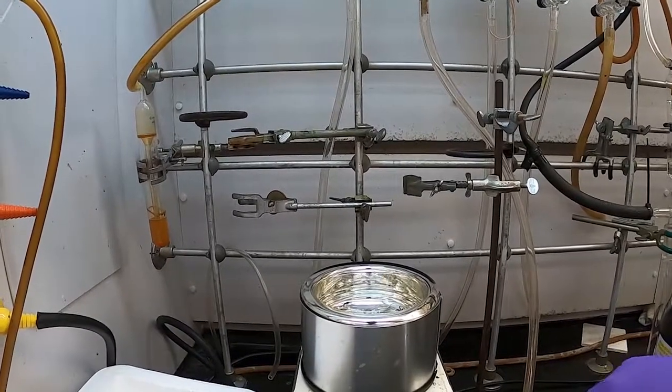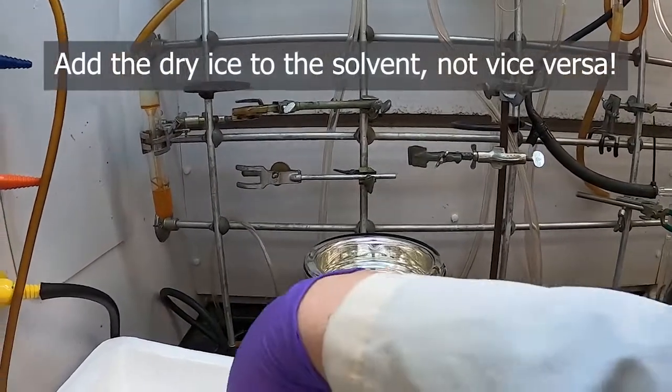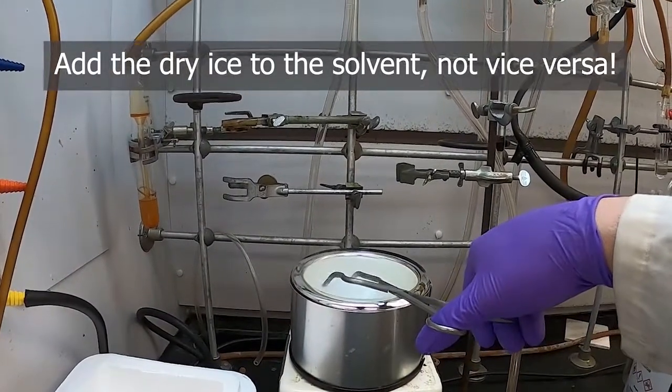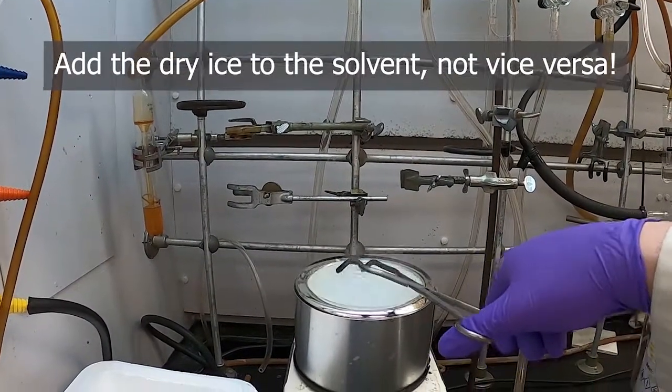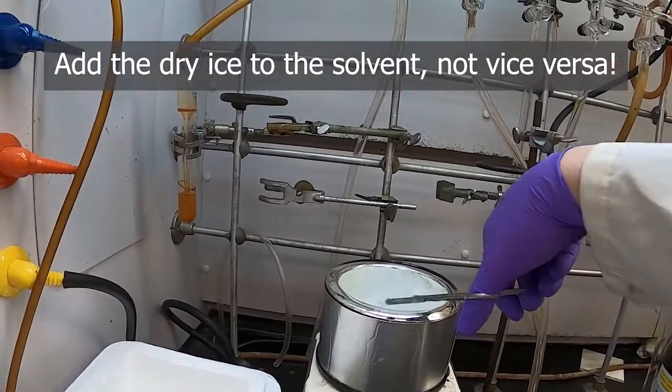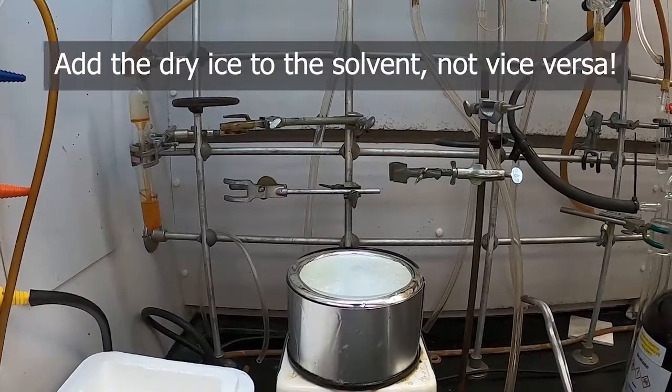And then we want to add dry ice to the acetone slowly so that we don't end up with it kind of boiling over. Because as we add that, that was a pretty big chunk to add, so we are getting some boil over anyway.